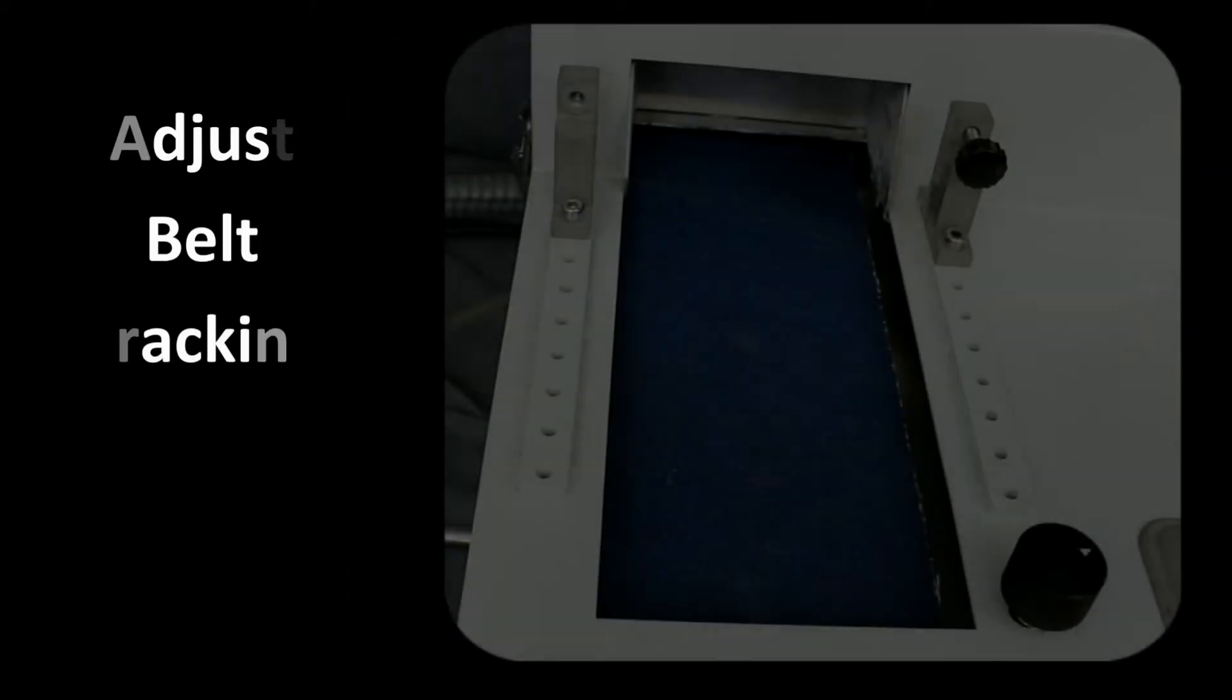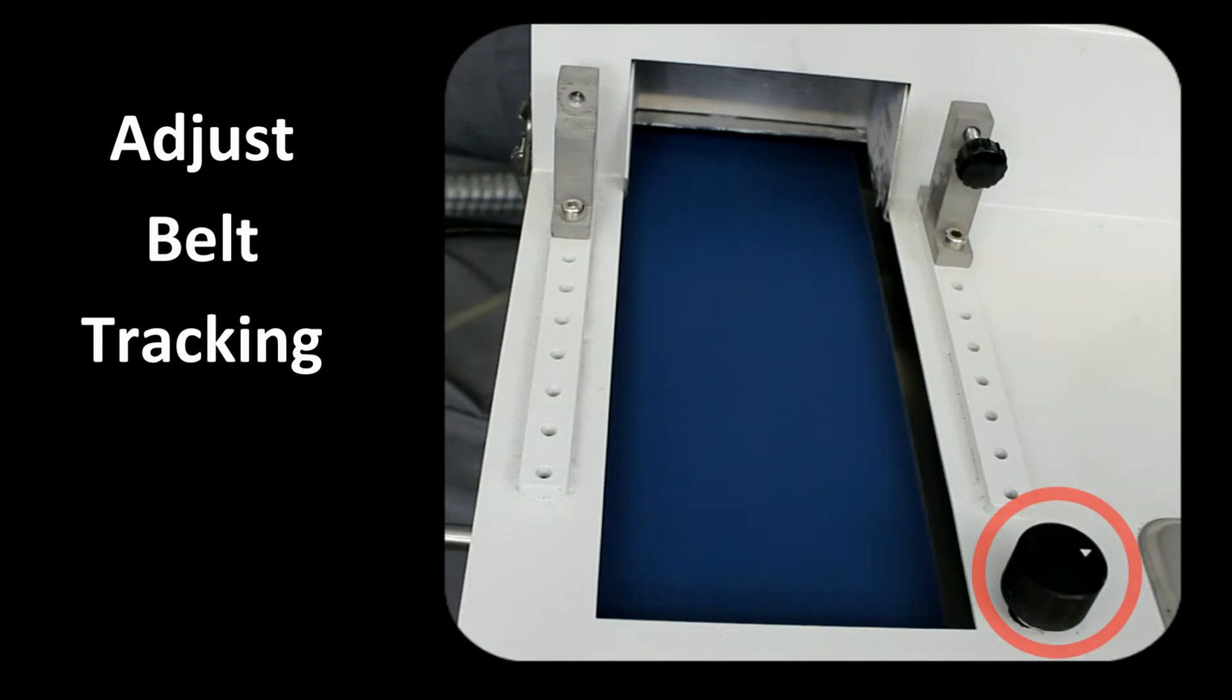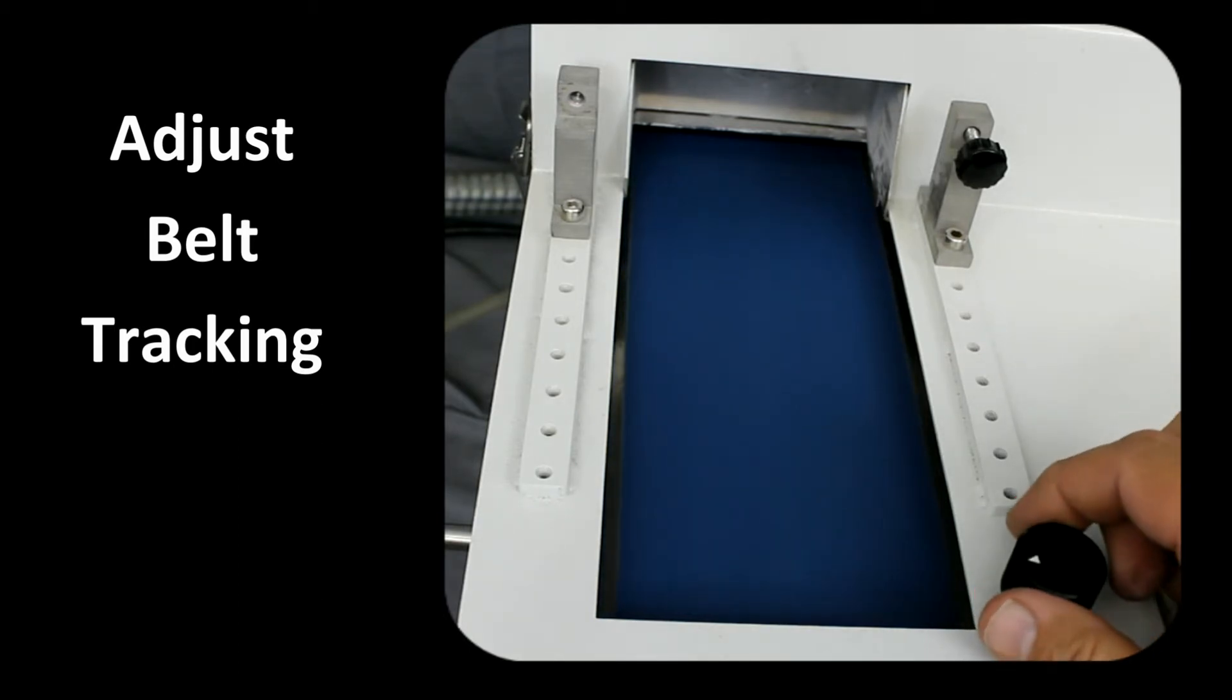The belt tracking can be adjusted with a knob located on the front right by the belt so that it tracks in the correct position. Slowly adjust the knob so that the belt tracks in the middle of the wear plate.